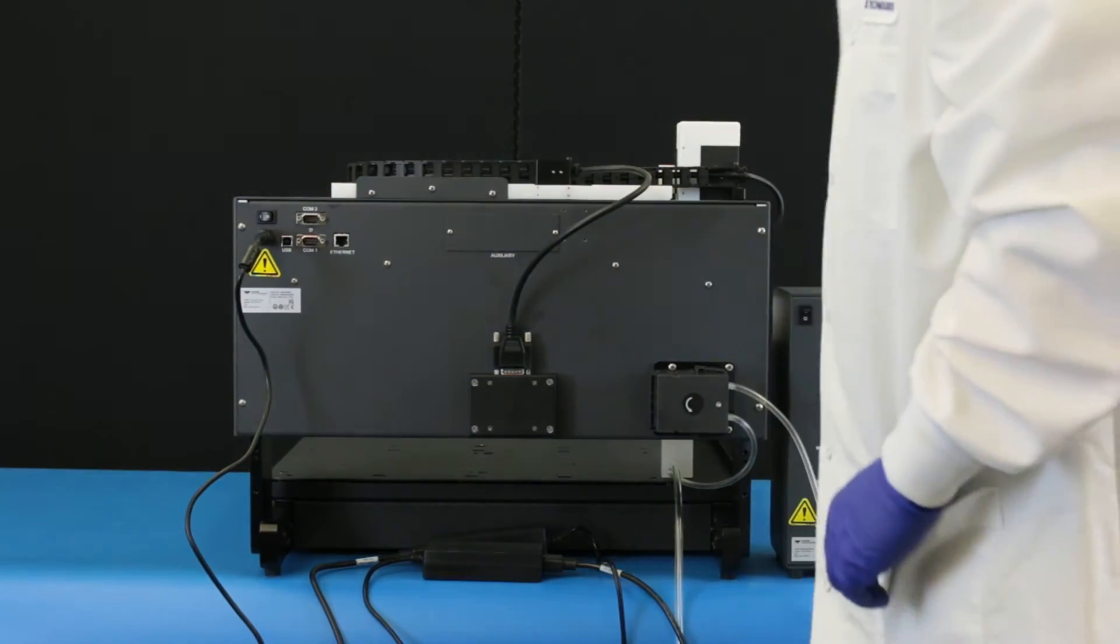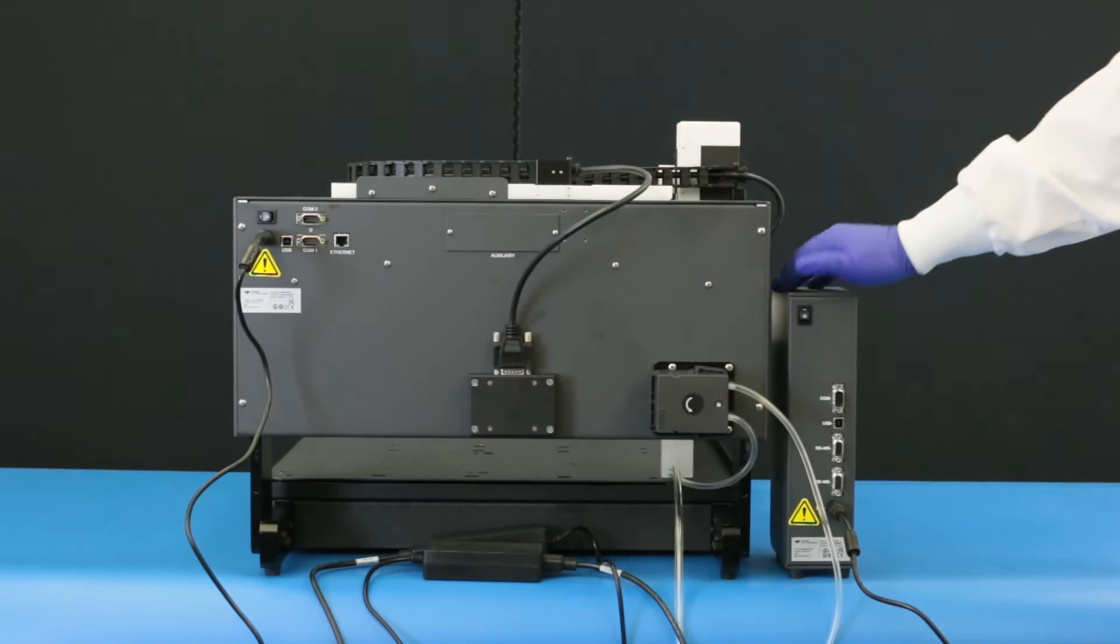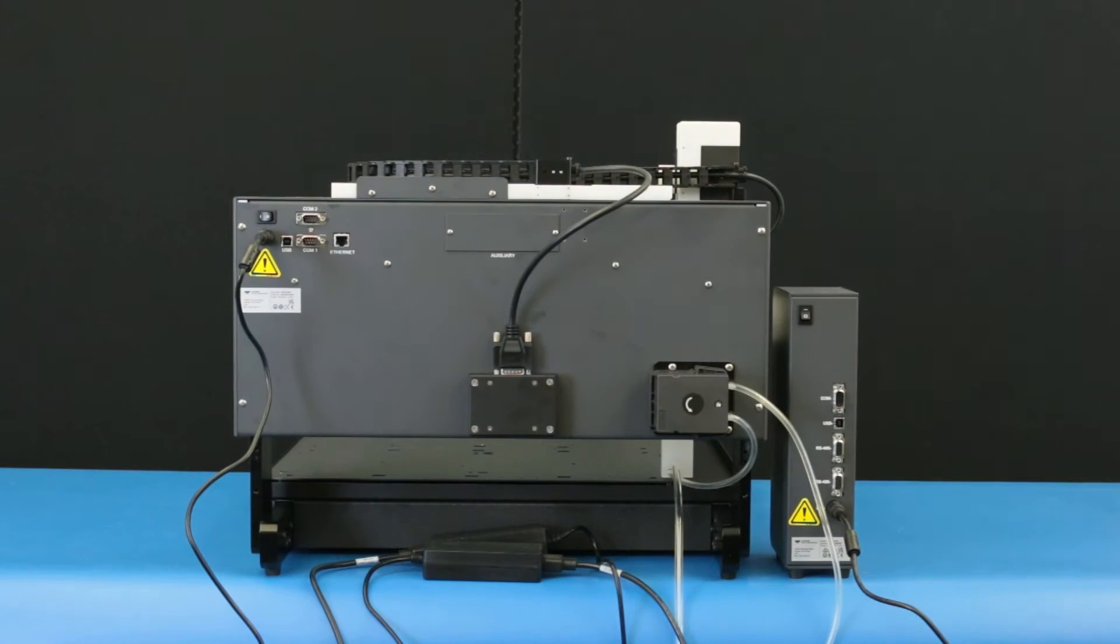Turn the power switch on the autodiluter on. Then turn the power switch for the syringe pump module on.